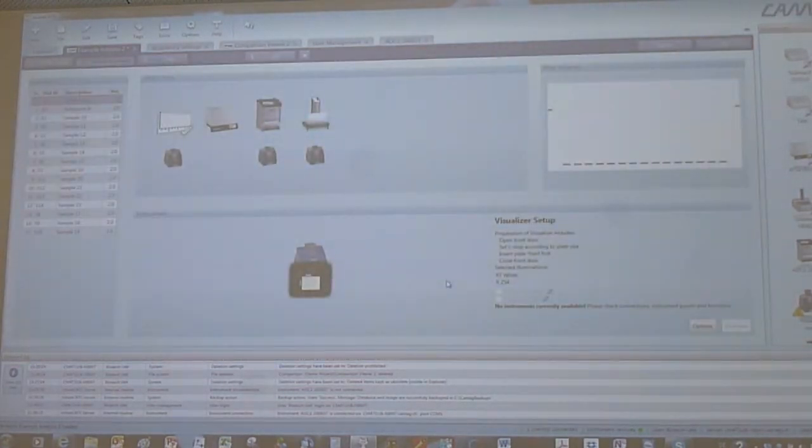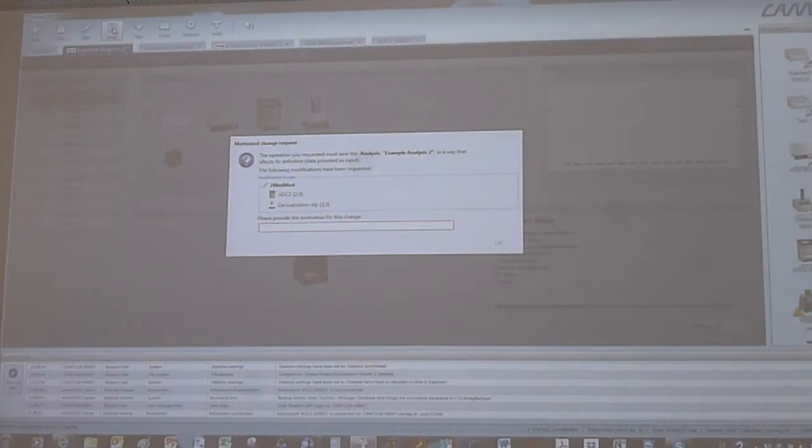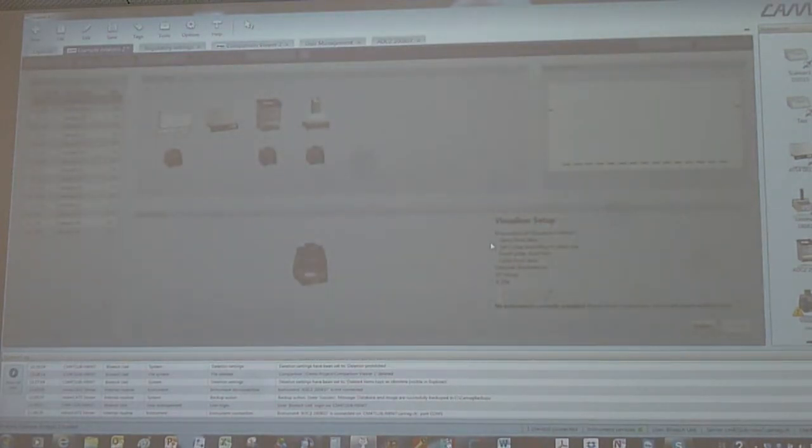And I say, okay, you see, I don't have to enter anything. And now, as soon as I save, it tells me, okay, in these steps you made these changes. And now I have to say, adjusted to humidity, just entering. And then I can say yes.